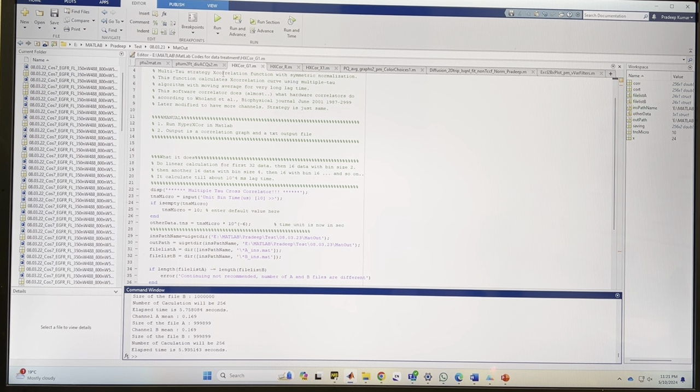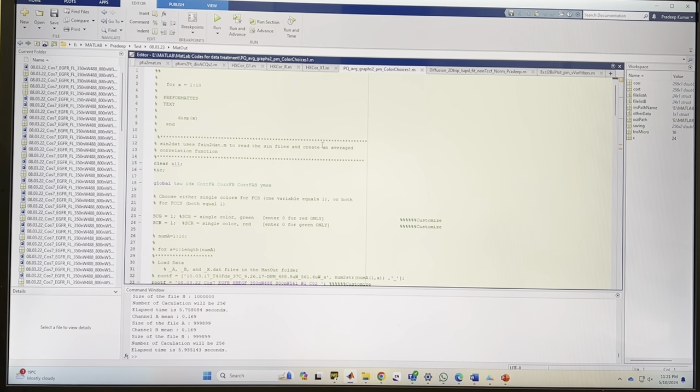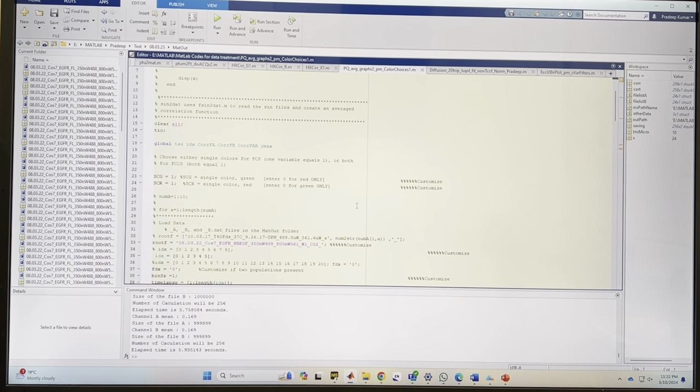Now we already used G1, R and X1, so I'll go to color choice now. In color choice, we record the data for 60 seconds, and I divide it into 6 different sets, 10 seconds each. For that, you can see here, this is the code we have. You see here, we divided the 60 seconds into 6 different slots, so we see 6 different graphs of that. I'll show you that soon.